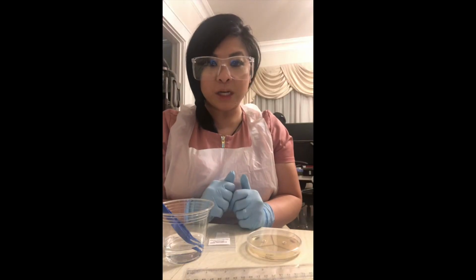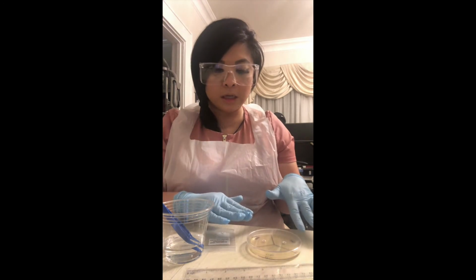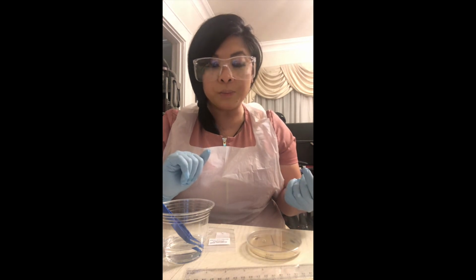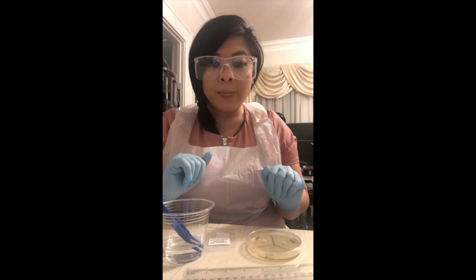Hello, this is a continuation of my experiment, antibiotic sensitivity Kirby Bauer diffusion test. I allowed my agar plate to remain undisturbed, lid side up, for about 2 hours now, until the broth has been fully absorbed into my agar.